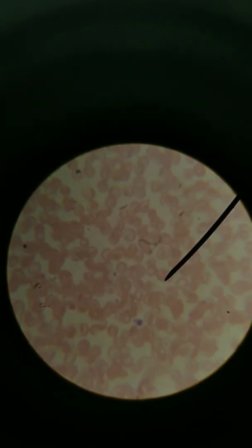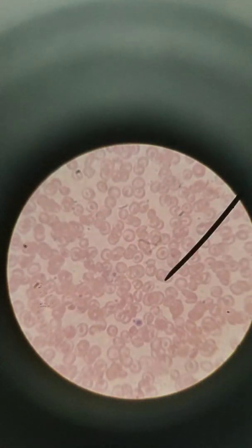Let's take a look at an irregular one. Let's start with a classic one. Hopefully you can tell what it is by looking at it. Let's see if I can get it in focus immediately. There we go. Almost. Work on the contrast and lighting here. Great.